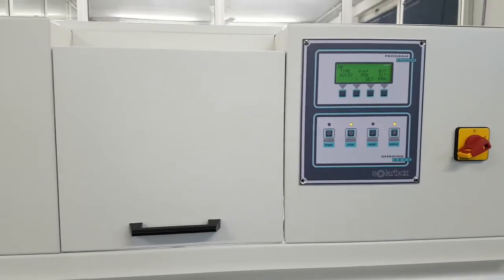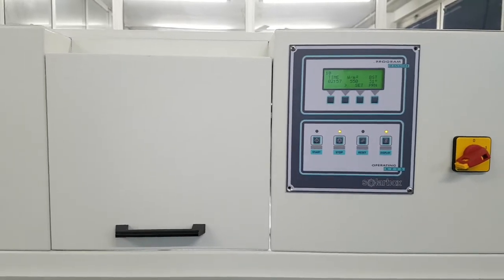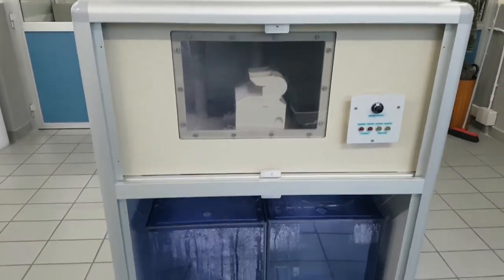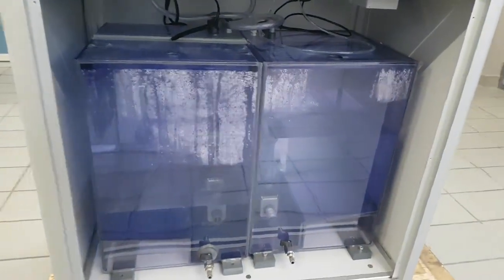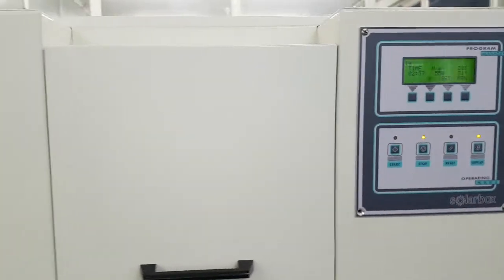This is a Solar Box 1500 E model RH with humidity control. You can see all the equipment. This is the humidifier — an ultrasonic humidifier. These are the tanks. This one is for the humidity control, and this one is for the flooding control. And this is the chamber.